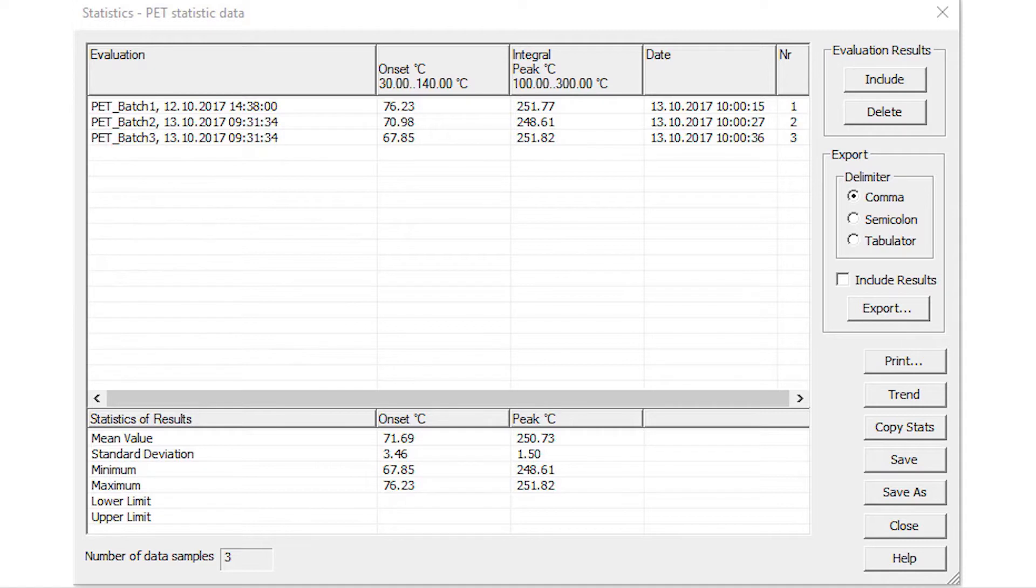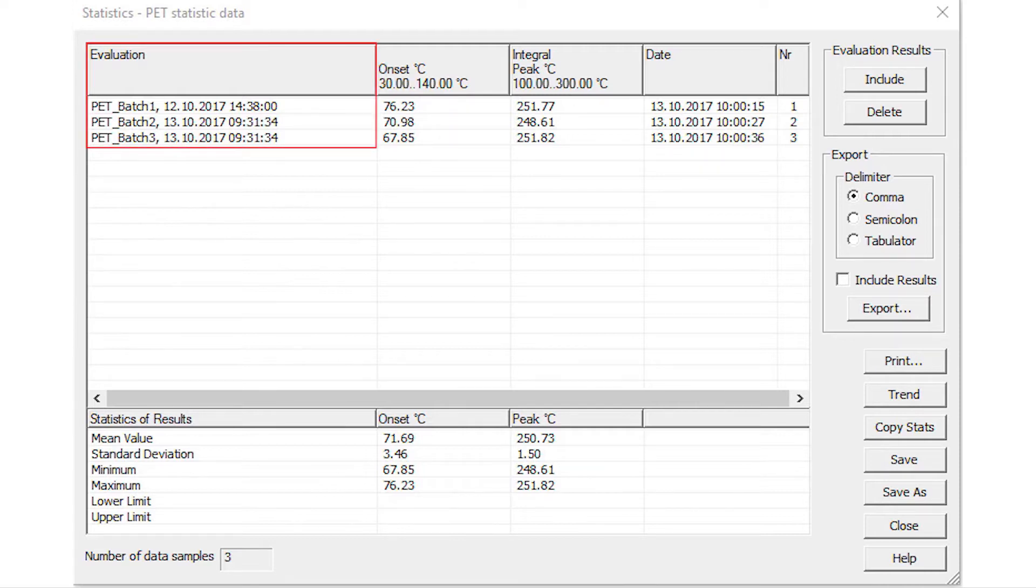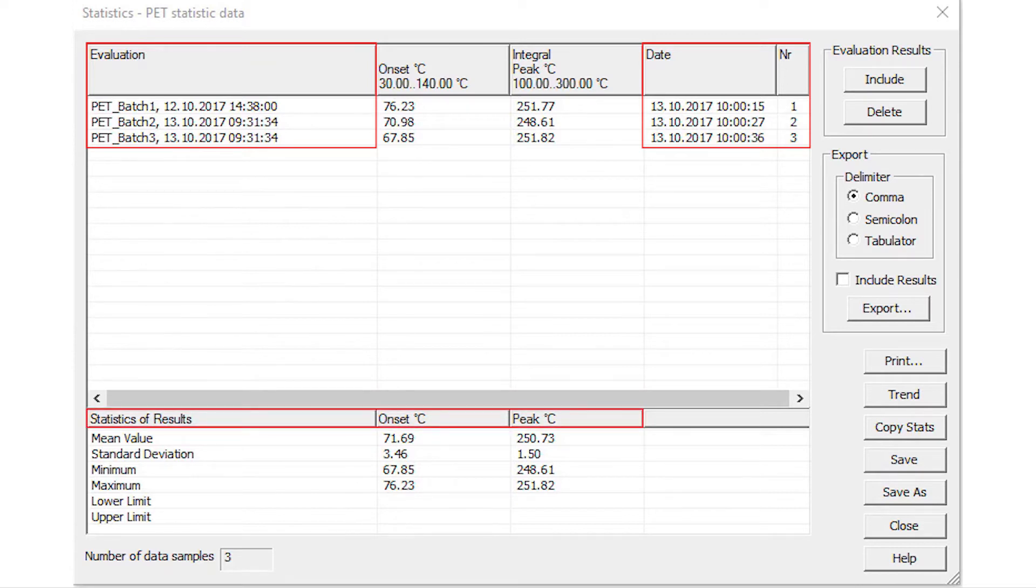The results that fit into the ranges defined in the template are included and displayed in the upper table. The Evaluation column displays the name and date of an evaluation. The Date column is the time the evaluation was added to the table. Results are displayed in the remainder columns as defined in the template. The following statistics are automatically calculated in the lower table.